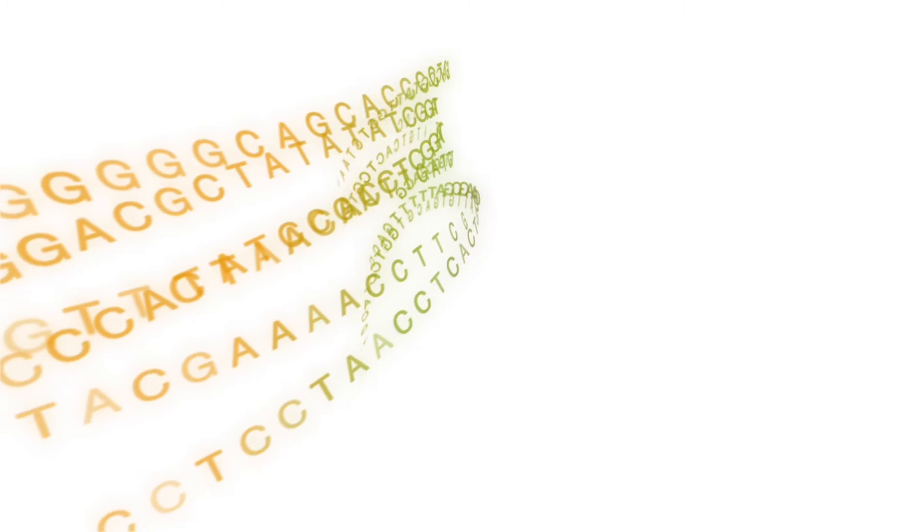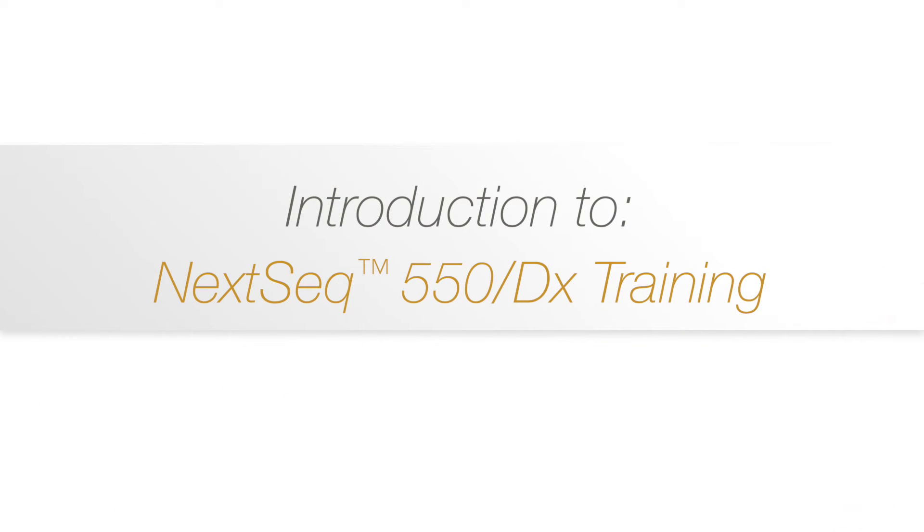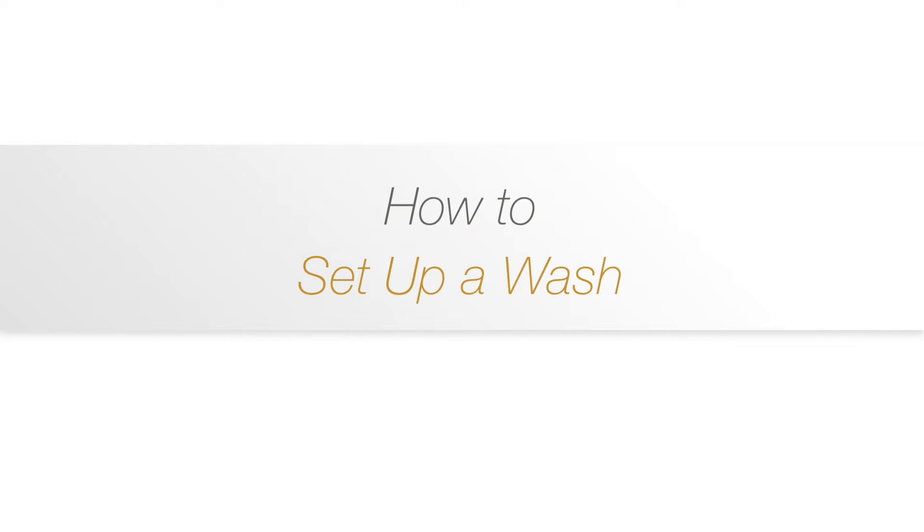Welcome to the introduction series to the NexSeq 550 550DX training. This movie clip will show you how to prepare and run different washes on the NexSeq 550 550DX.